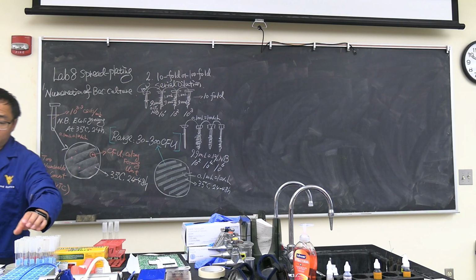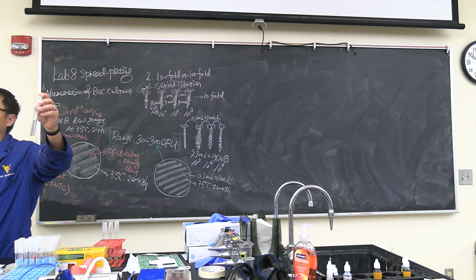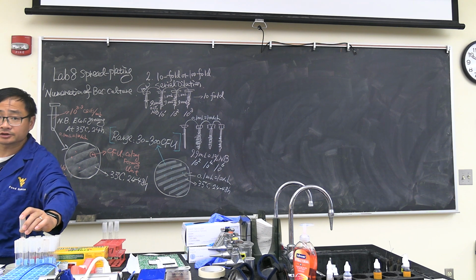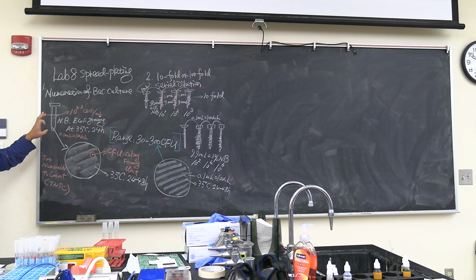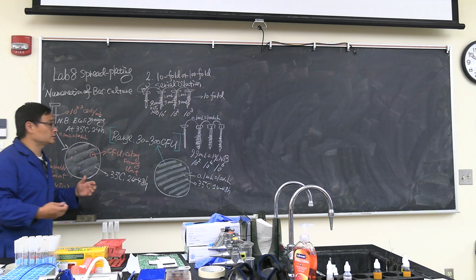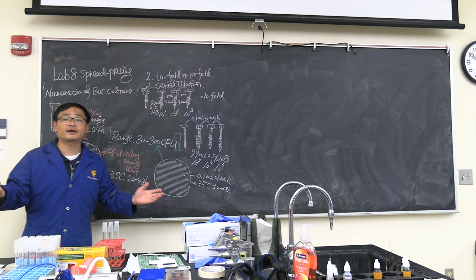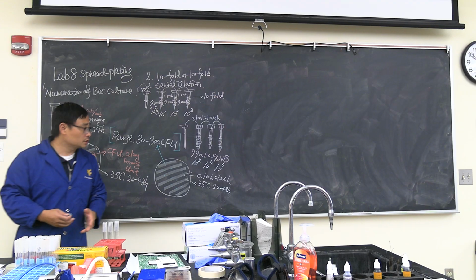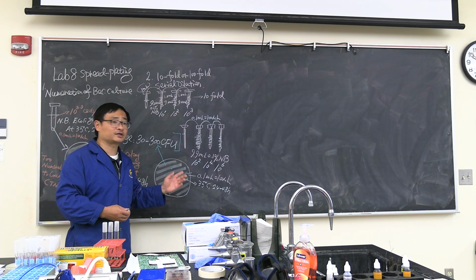So for example, I've been working for 20 years. I know this is approximately 10 to the power of 8 cells. That's a lot, 100 million. If you're working in the juice industry, you should know it's approximately maybe 1,000 cells sometimes. So that's an estimation. Second, you need to estimate how many dilution tubes you need. That's to be prepared.